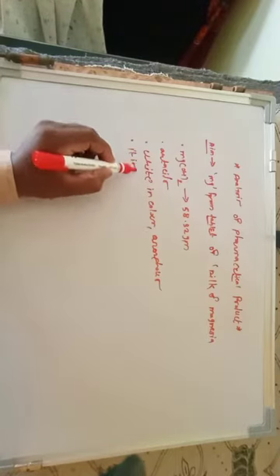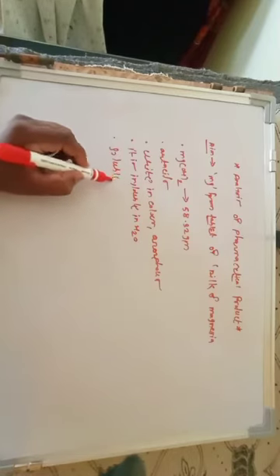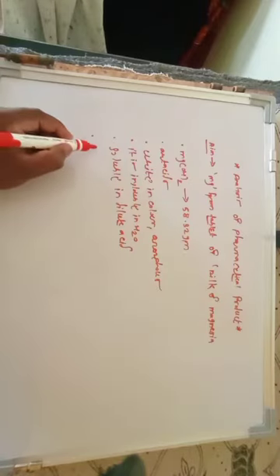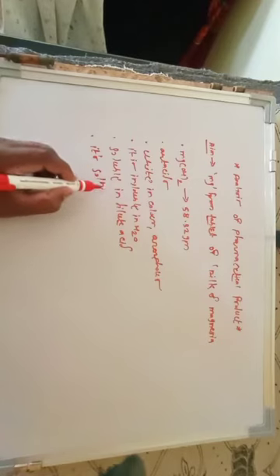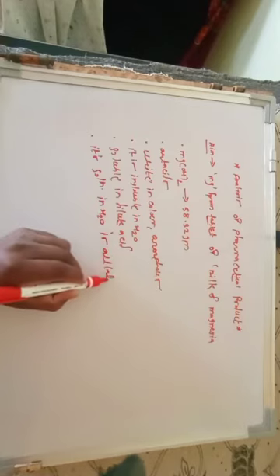It is insoluble in water and soluble in dilute acid solution. Its solution in water is alkaline.